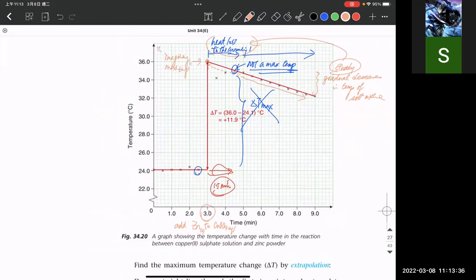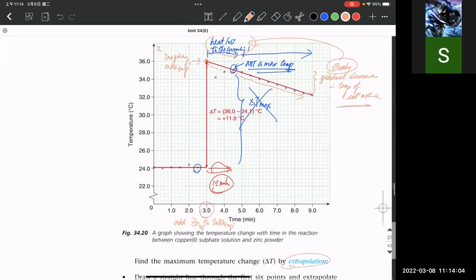Of course, if you write down imaginary, it is rather subjective, isn't it? But that type of so-called not true data is indeed based on some scientific findings. It is from the projection of the gradual decrease in the temperature of solution and you project it upward. So we will not say it like this way. We call this type of technique extrapolation.